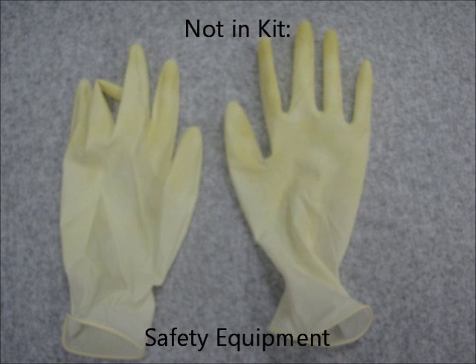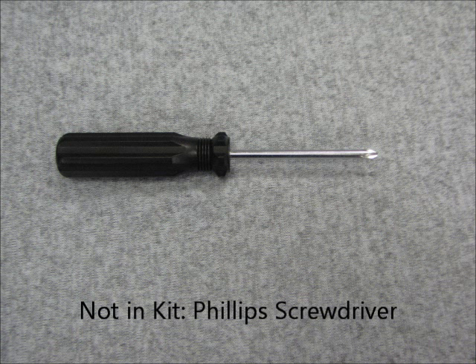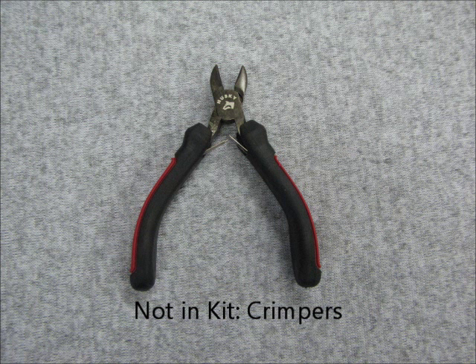There are items not in the kit but that will still be required. These items include safety equipment such as gloves and goggles, a Phillips head screwdriver, and wire crimpers.